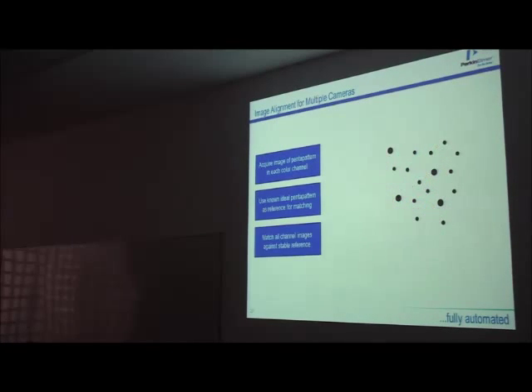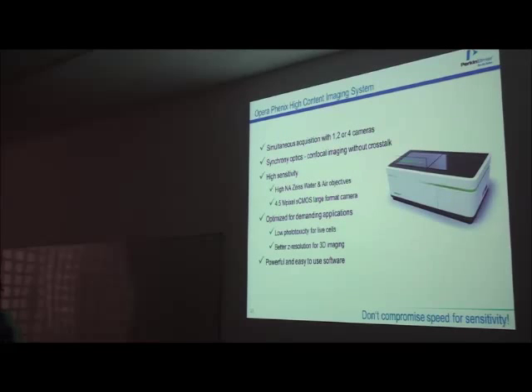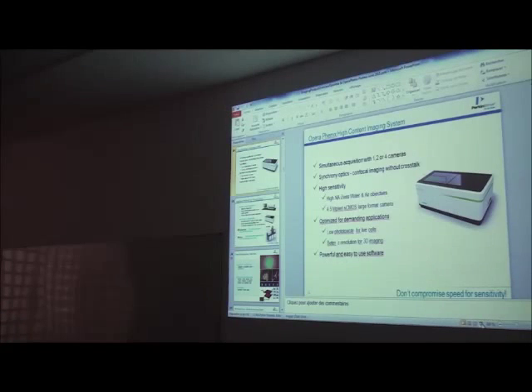I'll just skip this part because this is something you don't need. That's called the alignment, an automatic alignment process, so you don't have to worry about references, everything is done automatically. But that's a good point.